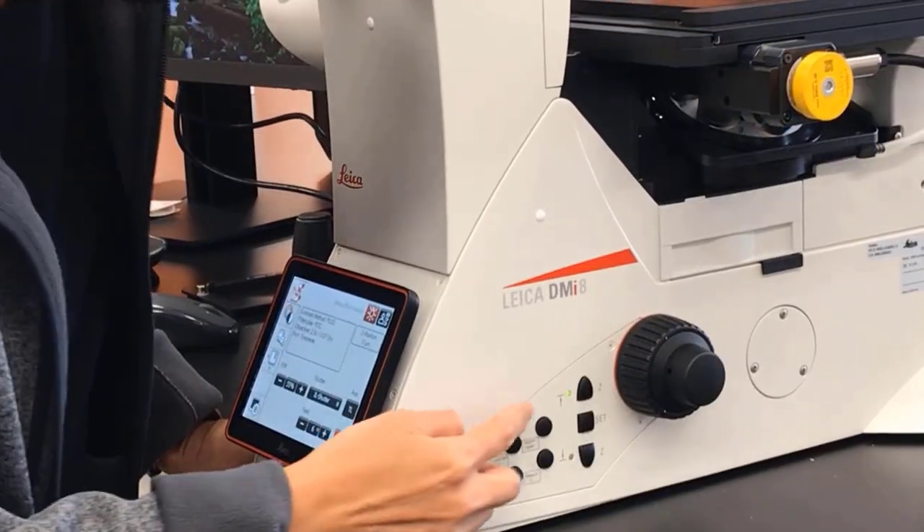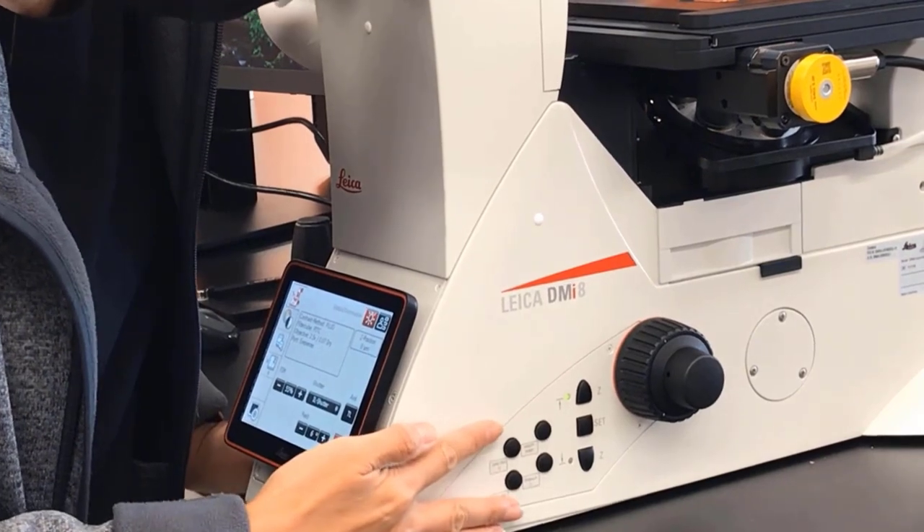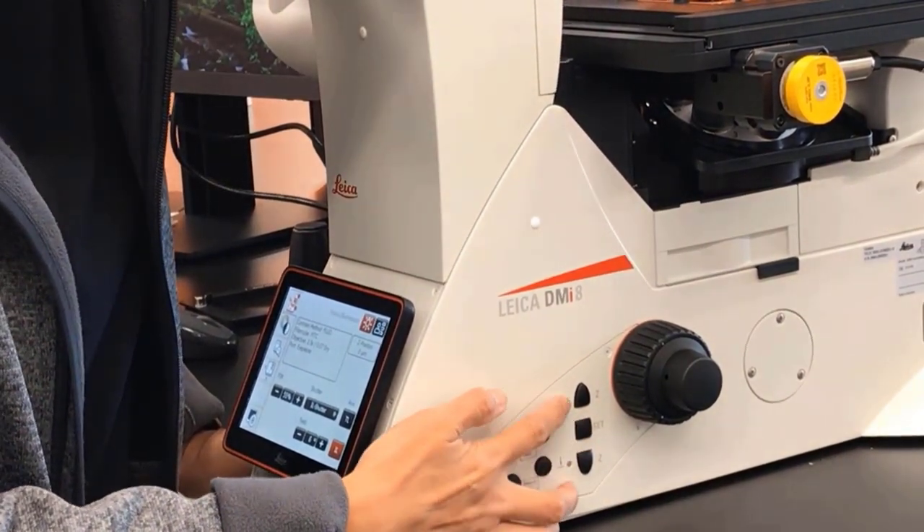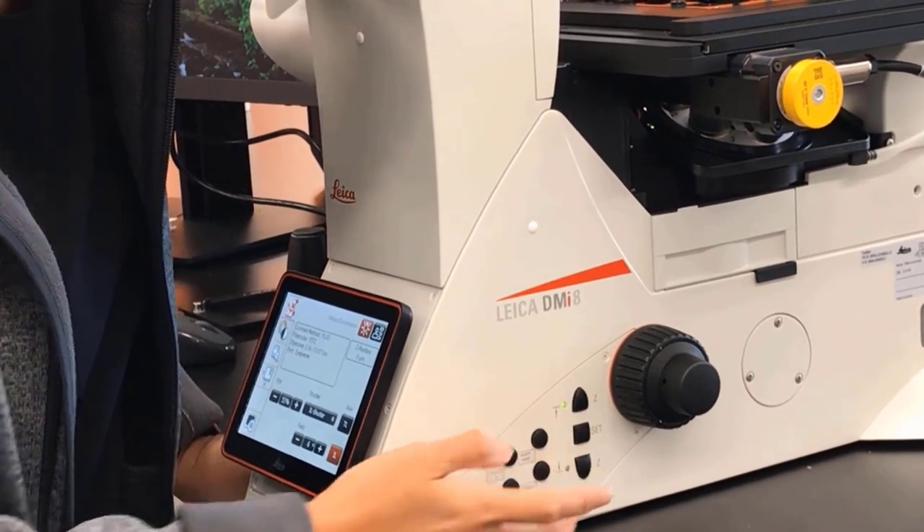On the right side of the microscope, we have buttons to set the Z focus, the Z escape, and then four programmable buttons for anything of your choosing.